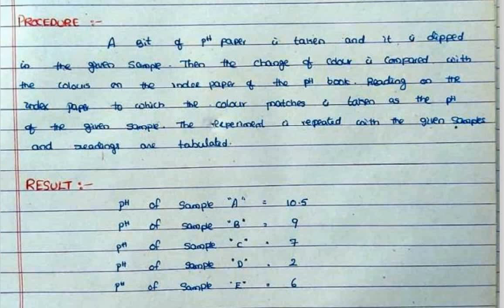The reading on the index paper to which the color matches is taken as the pH of the given sample.